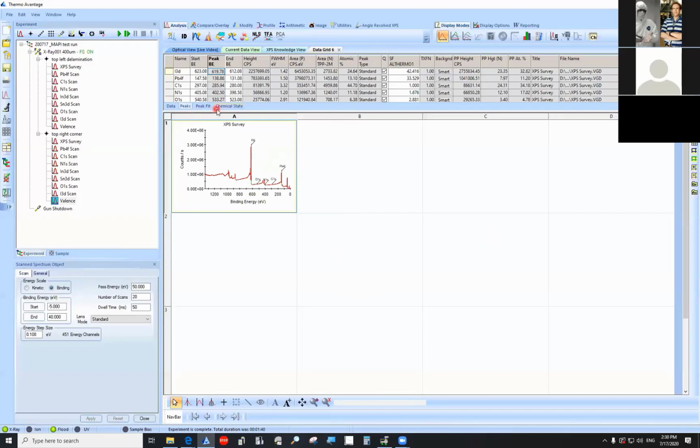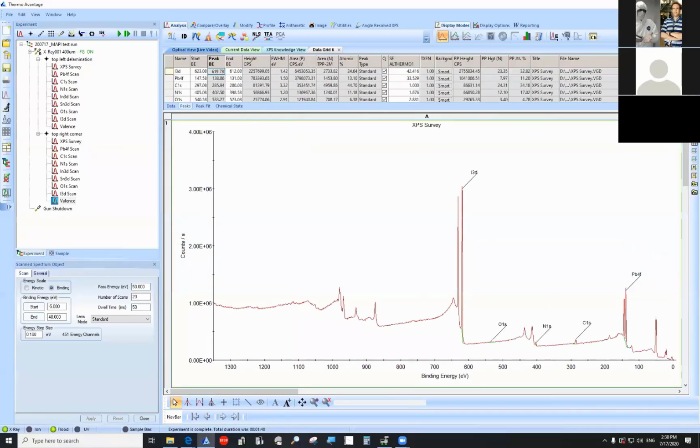The simple thing that you want to check for right now, even though we haven't really done any kind of massaging of the baseline process or its quantification routine, is just make sure that you see some kind of a reasonable amount of atomic percentage for the species that you were expecting. And more importantly, in the survey spectra, which I can look at in a larger view here. Oops, sorry, maximize current cell. That's this little button right here. Do I see what I was expecting?